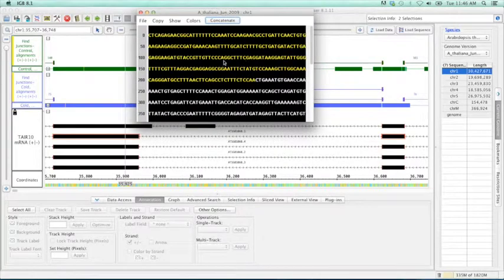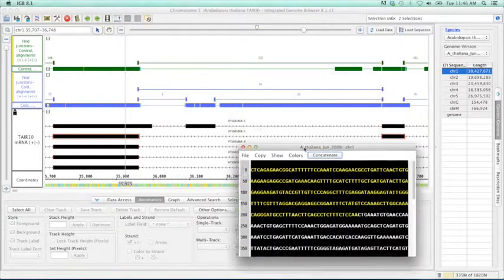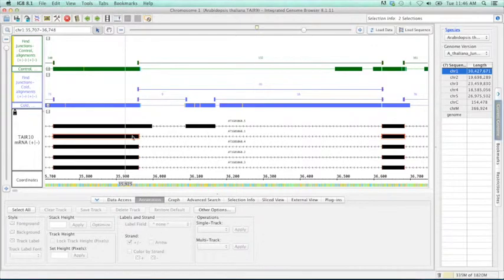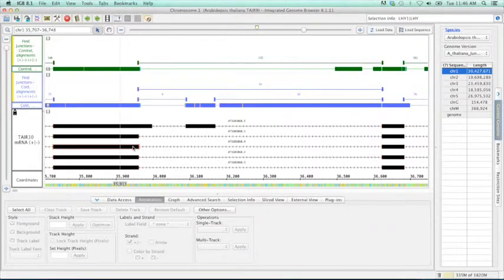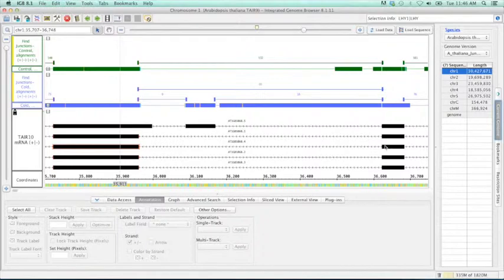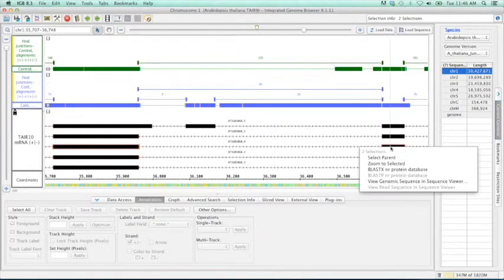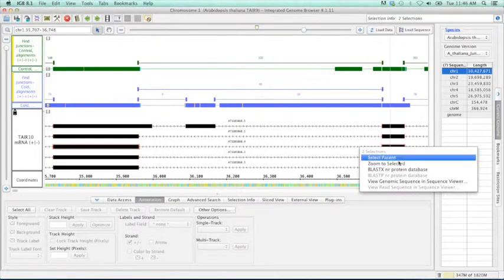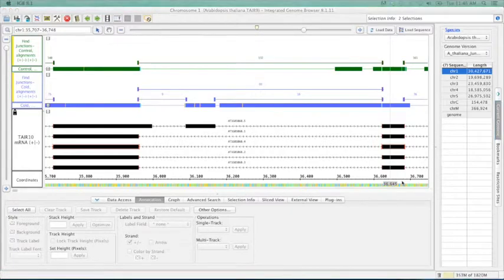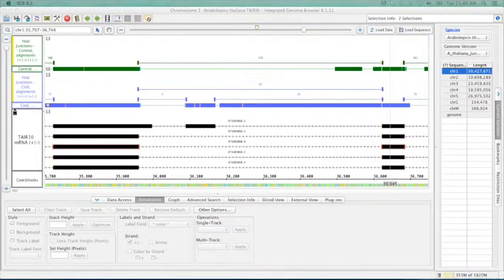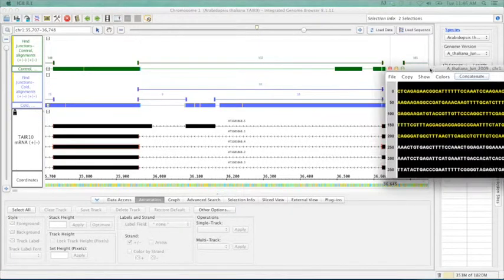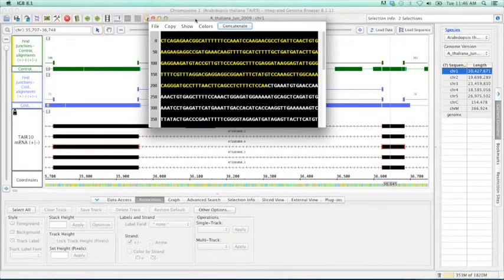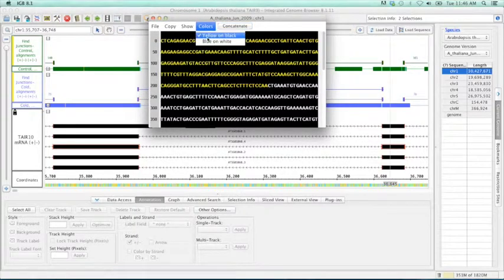How did you get that box to show up? That was shift click on the flanking exon here. And then I'm going to shift click on this other flanking exon on the other side. And then right click and view genomic sequence and sequence viewer.